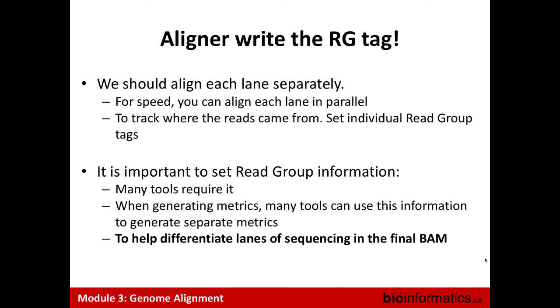You will do your alignment by read set, and each read set is one experiment from the sequencer. So you take all your read sets, you align them, then you merge them, and then you start to look at your variants, or structural variants, or specific patterns, and you start to see something unusual. So you will take your BAM, look in IGV, and say, okay, split my reads for this region where I see this weird pattern, split my reads per read group.